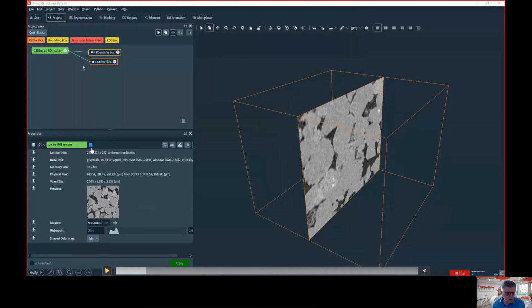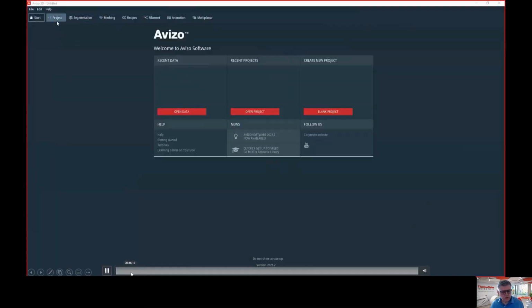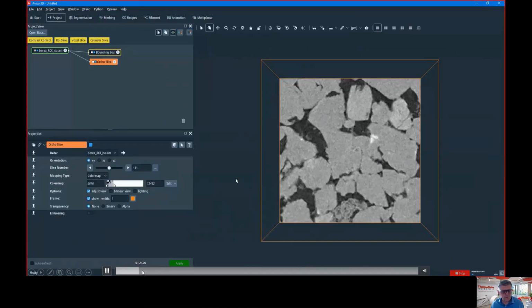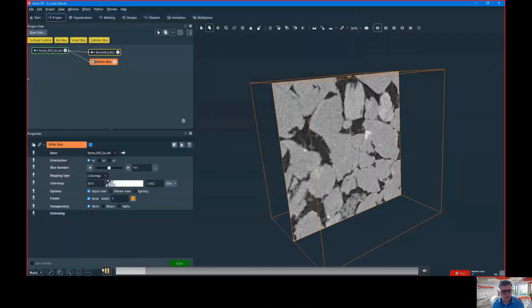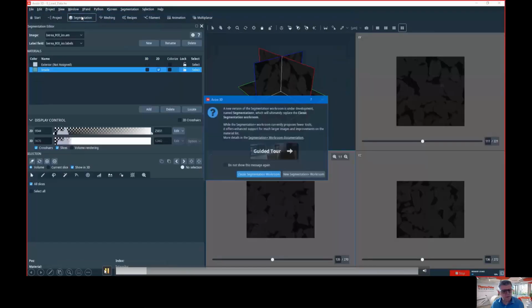Segmentation is, you will see what it is. I click... sorry, I clicked in the wrong place. Yeah, it's because it's a video. Could happen. So I go back to my video, and yeah. So segmentation. What happens if I click segmentation?